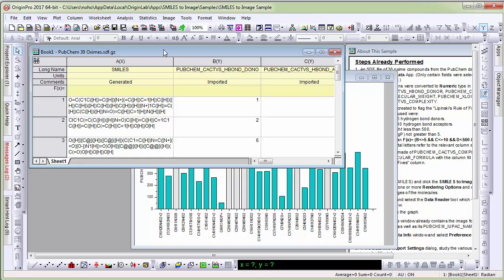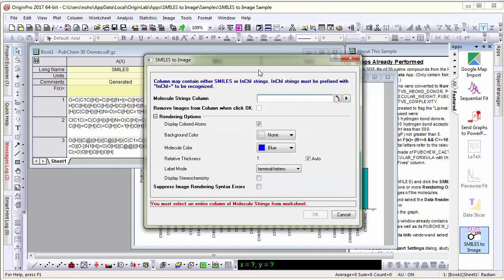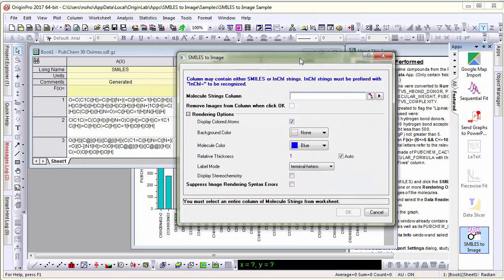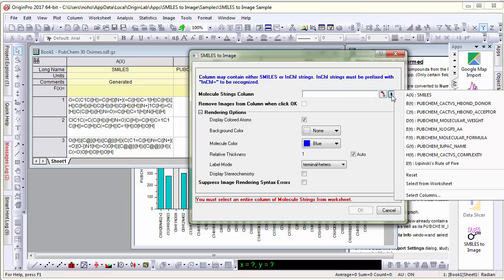So with the worksheet active, let me open the app. The first control here is to point to the column that contains the smiles or inchy strings. In this case, smile string.